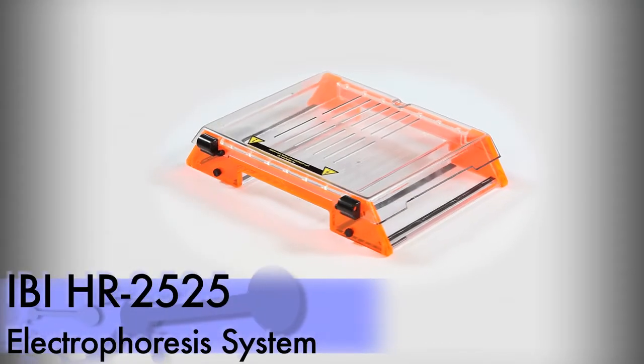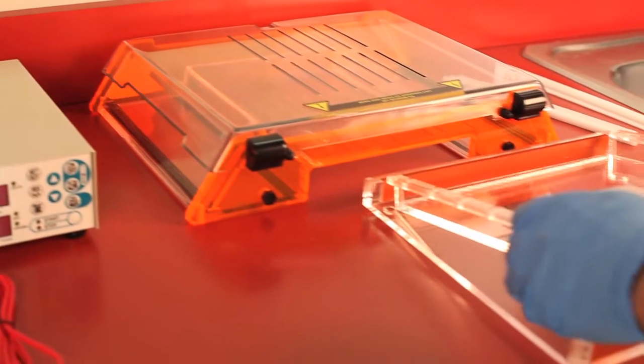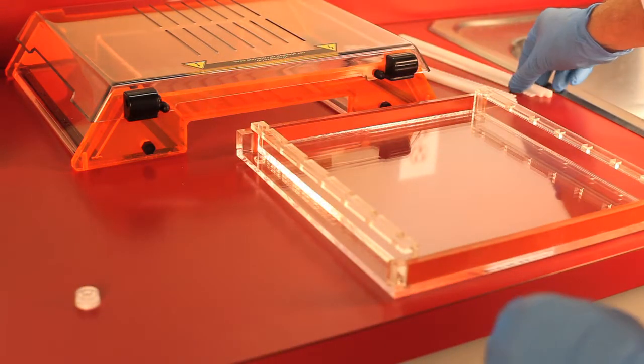The IBI scientific high-resolution and throughput horizontal electrophoresis system is ideal for nucleic acids in agarose gels. The system was designed for rapid screening of PCR fragments, field inversion, and other electrophoresis procedures requiring circulation.